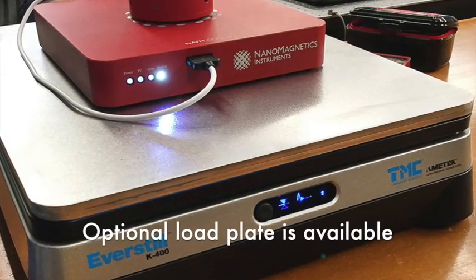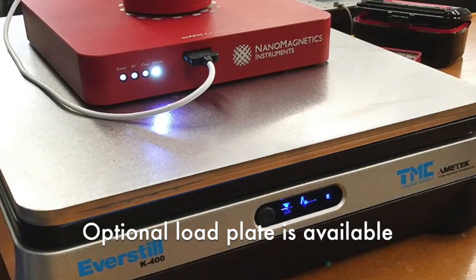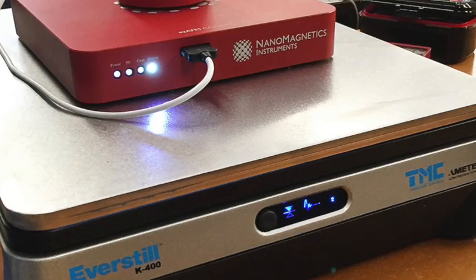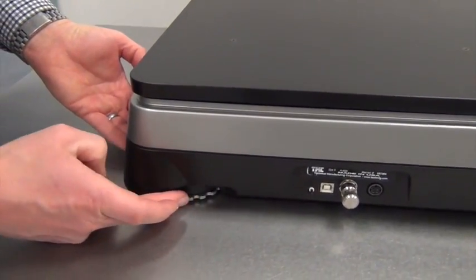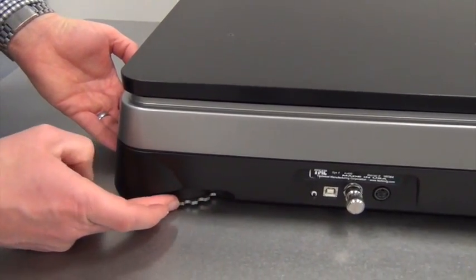With a load capacity of 50 to 330 pounds, TMC can provide an optional load plate if your instrument is less than 50 pounds. After setting the K400 on a stable surface, it's easy to check if the bottom surface is resting evenly on what might be an uneven table surface.